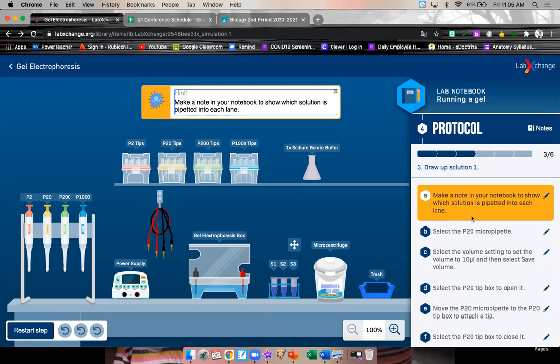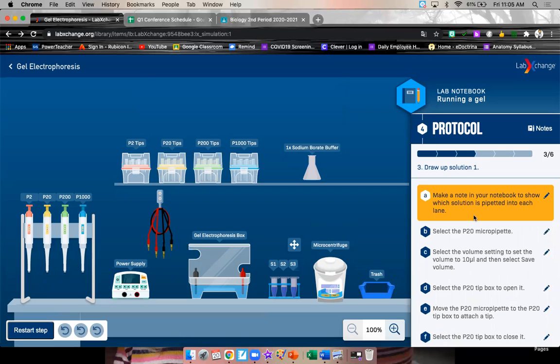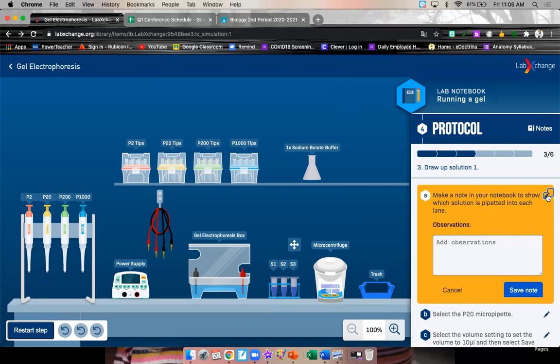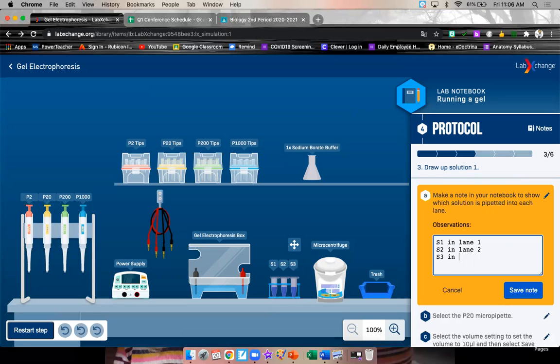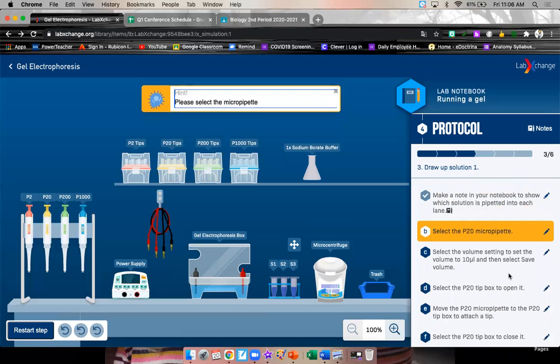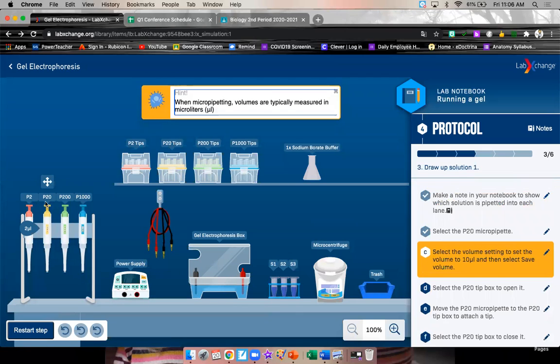Make a note in your notebook to show which solution is pipette into each lane. We didn't do that yet. I don't know why it sounds to it first, but see this little pencil. So you can write whatever you feel like writing. S1 in lane 1. S2 in lane 2. S3 in lane 3 is what we plan on doing. Select the P20 micropipette that's over here. That's the yellow one. So it says P20 right here.